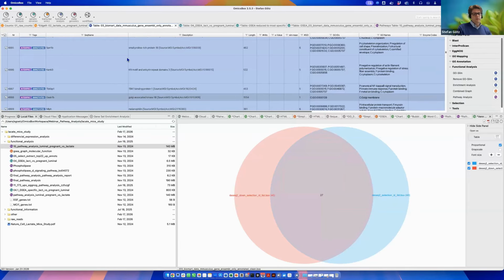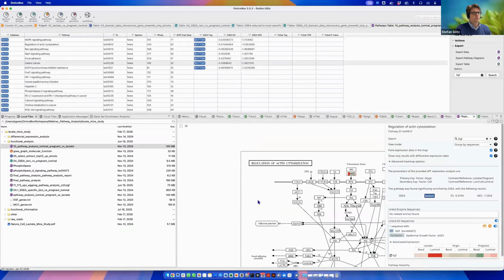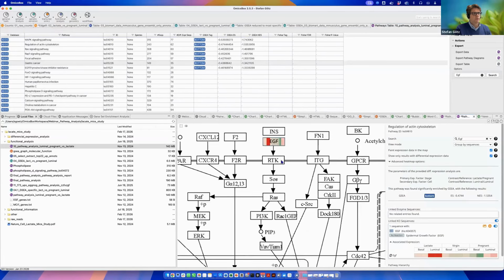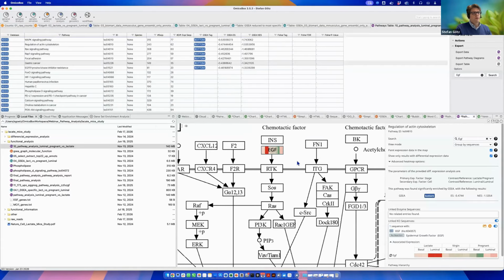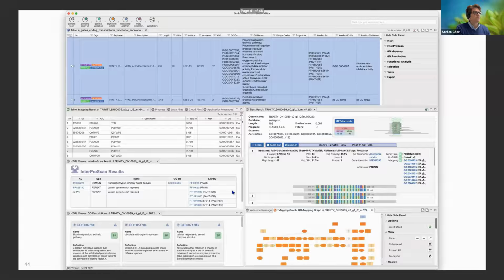For the human ones, you have what you have. But for the transcriptome, where you generate the annotations from scratch, you can really then make wise decisions and say, okay, with the annotation filters I used, I only got 50% of my genes annotated. So let's at least make sure the most up or down regulated ones are functionally annotated, so that I can get a proper downstream enrichment analysis for those kinds of things. Okay. So with that, I'm getting back into my presentation, and I'll finish my demo here.